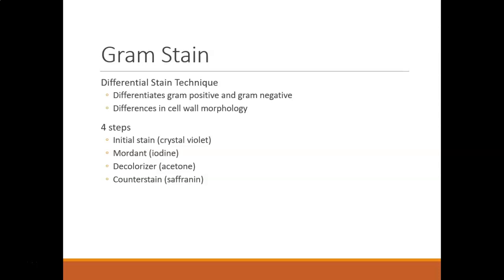Now we're going to get into some more interesting and more important stain techniques. These stain techniques differentiate bacteria based on certain characteristics. And so the first stain technique that we'll talk about is a gram stain.